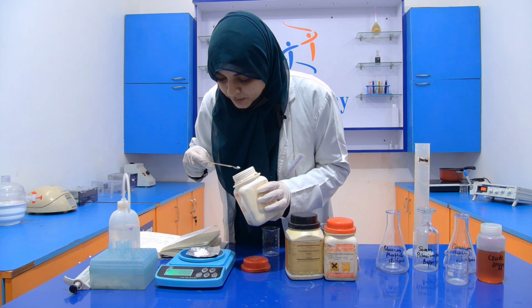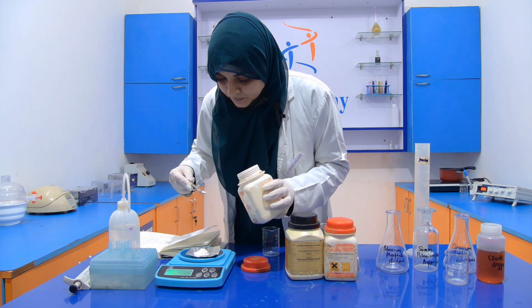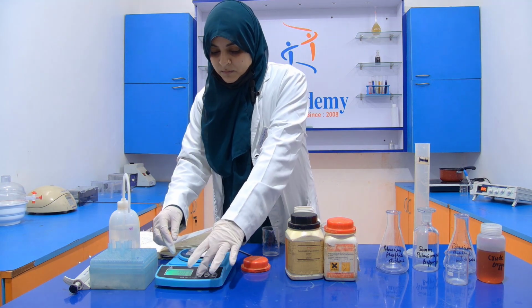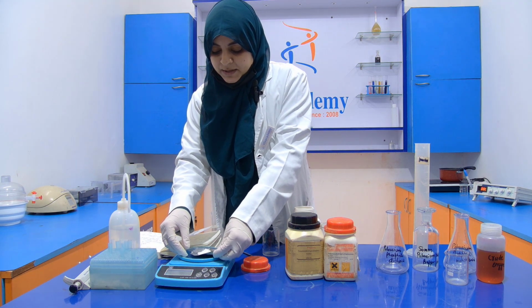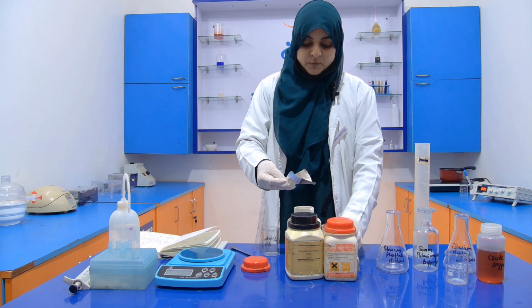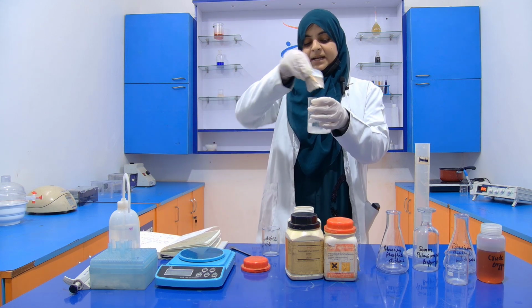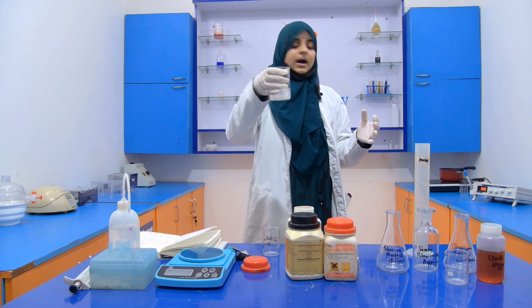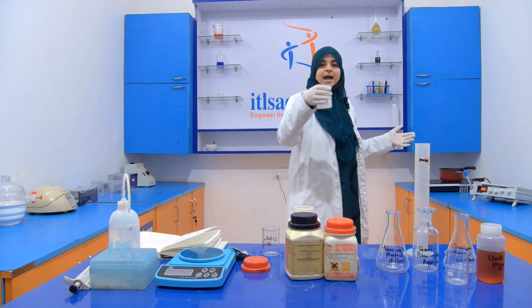Now it is 4 gram. Now dissolve this 4 gram, first of all, in 100 ml of distilled water. When it is completely dissolved, then the remaining 100 ml of distilled water will be added.